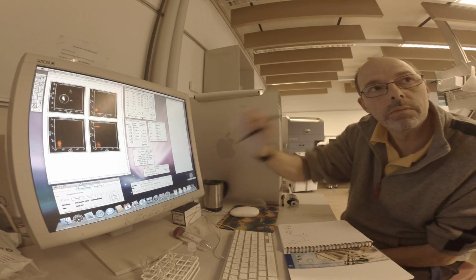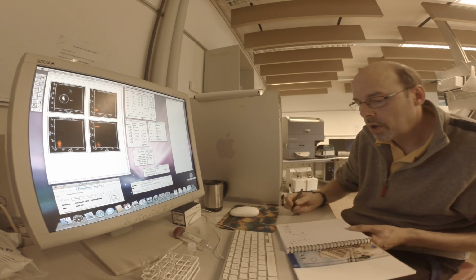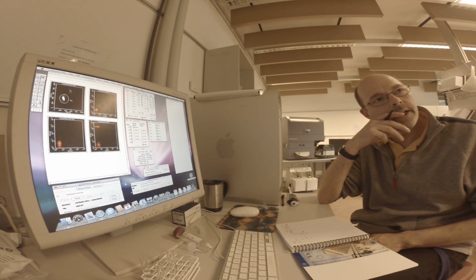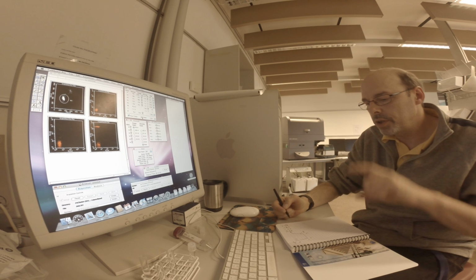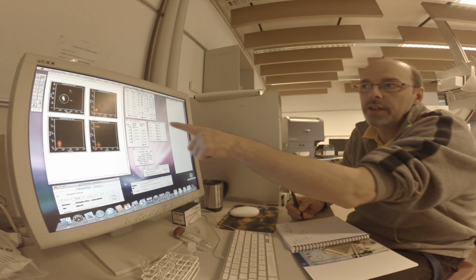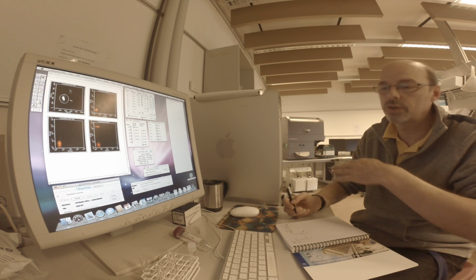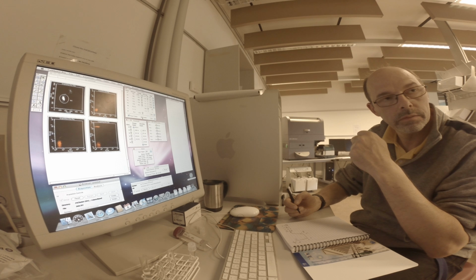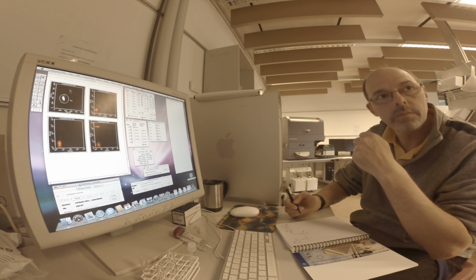So it gets readjusted. So 50% minus 15%. Exactly. Because then if you move the voltage up, this number goes up. But then you also have to change the compensation afterwards to make it fit on the axis. Yes. I think that's the way to go, actually.